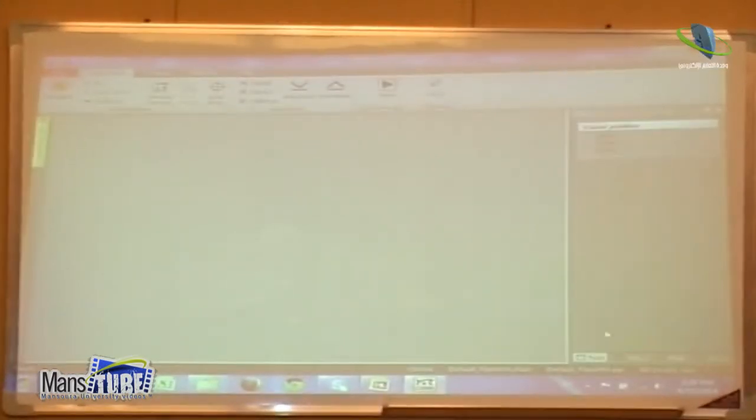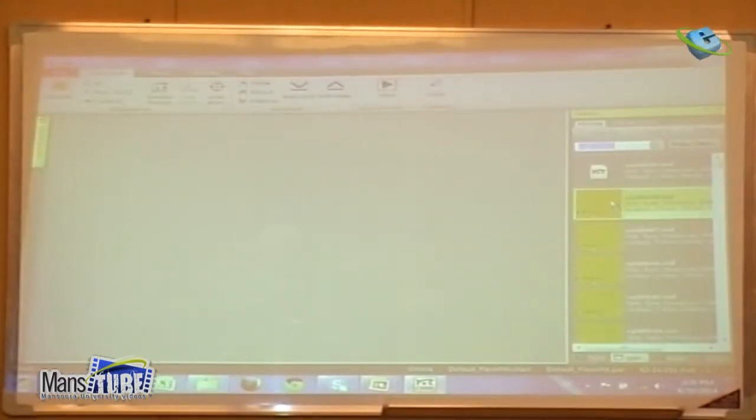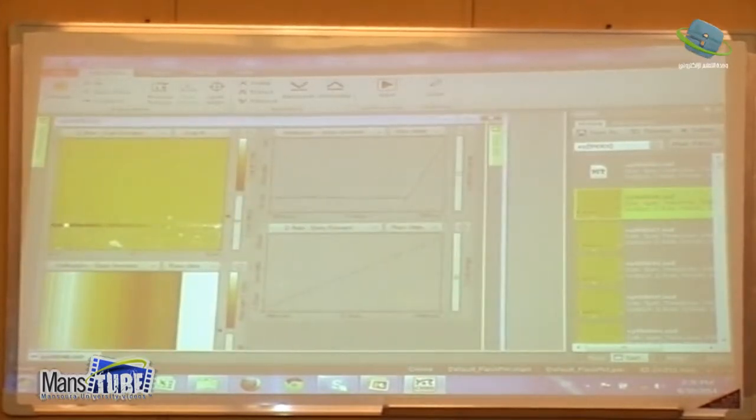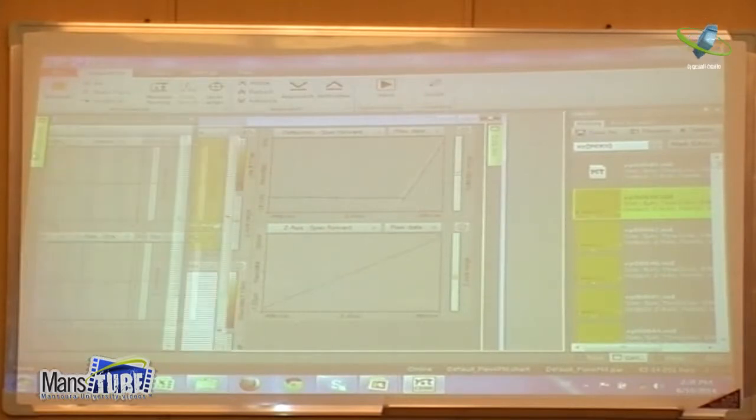Maybe you should go to gallery. Here there were 2 lines. The black one is forward, and this is backward. Now we can control the movement of the tip in one direction or in the other direction. We can control it in both directions.